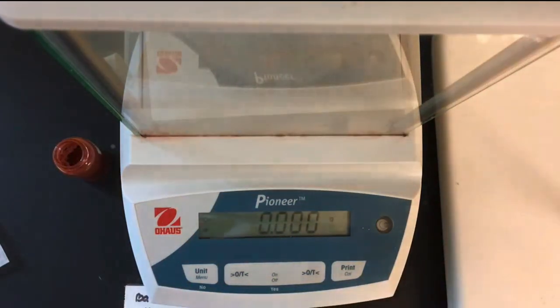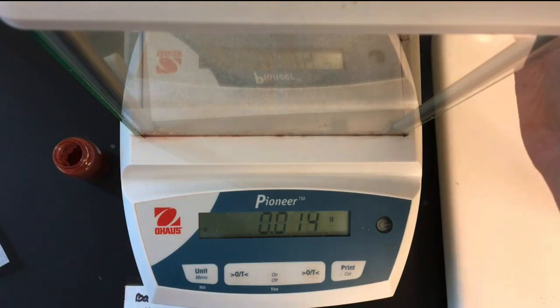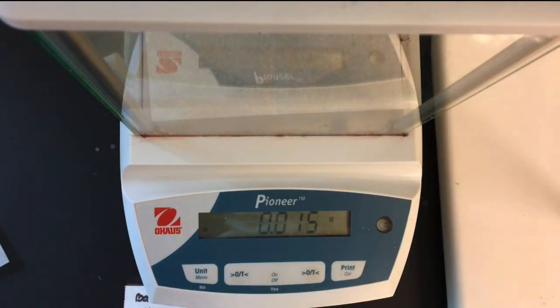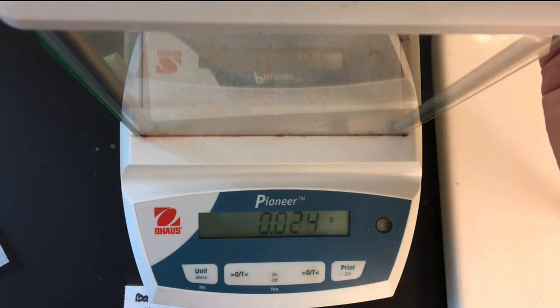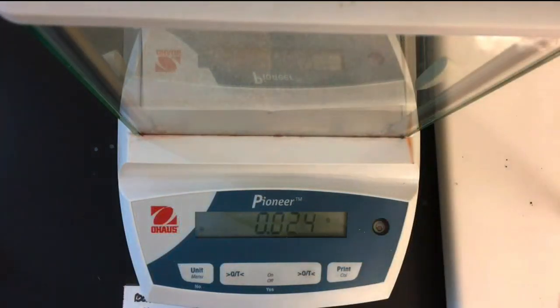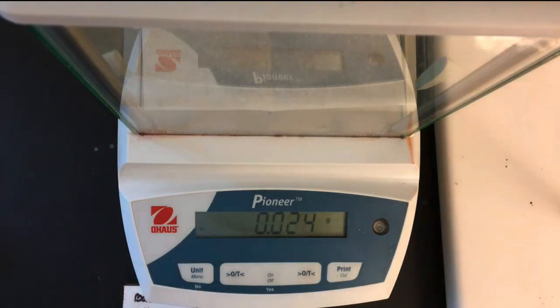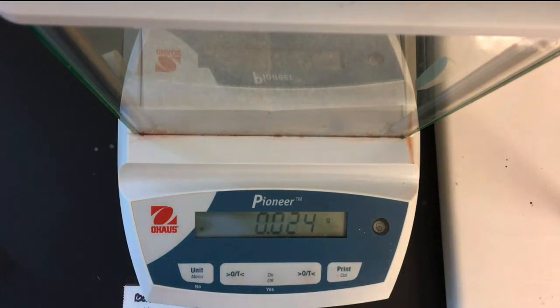Open the door. Looks like we need a little bit more. Oh, well, there you go. So now that we have 0.024, you want to write that down. Since, like I said before, we're doing less of our stock solution, we'll go through the calculation together. So write down that number, and then we will move on to making our stock solution and go from there.